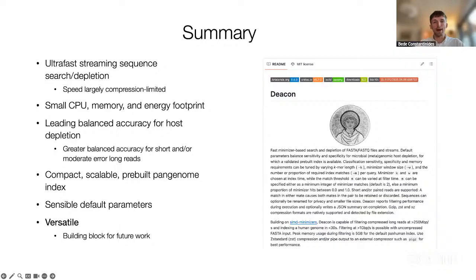Yeah, if we can do bioinformatics on a big, expensive server, that's great. But I think it's a lot better if we can do it on a cheap laptop in the field without internet access, allowing us to decentralize analysis, which is one of Arctic Network's goals. And this method is engineered in a way that it could run on a smartphone or miniature DNA sequencer or similar in the future.